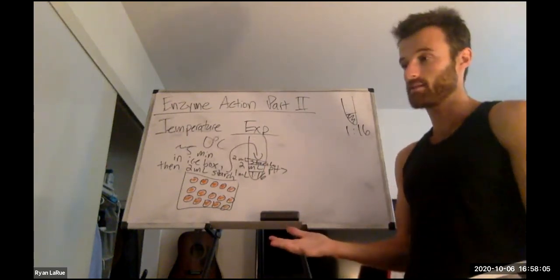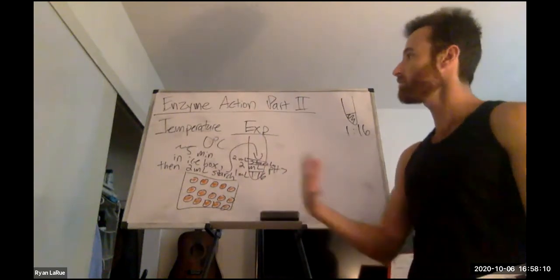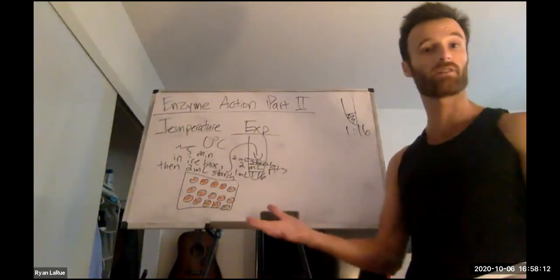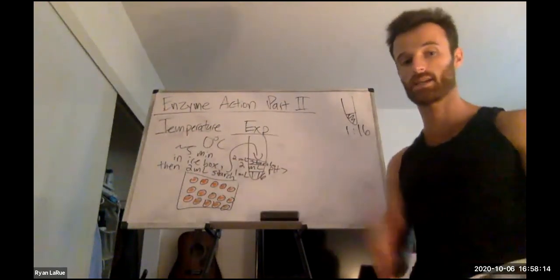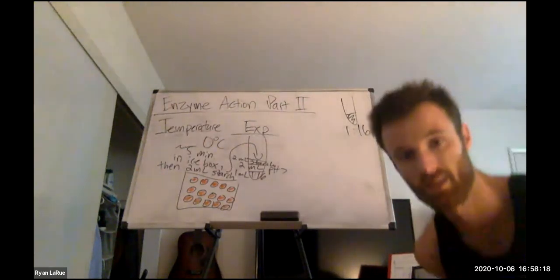As a hint, that's not really what happens. Enzyme activity will actually slow down, and that's part of why you do this experiment, to discover how these conditions affect enzyme activity and reaction rates. But that's it. That's what you do.